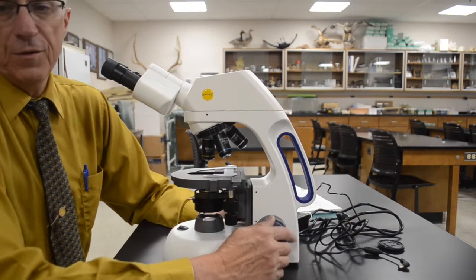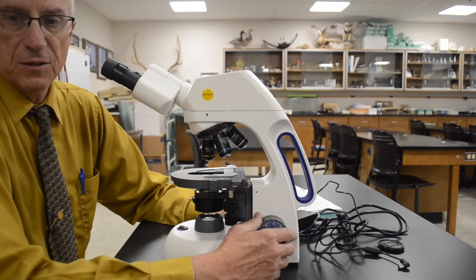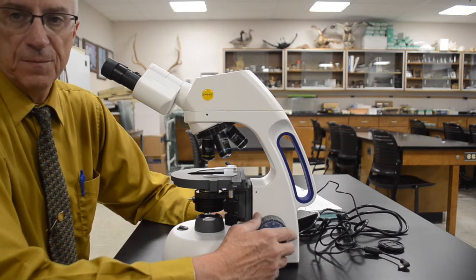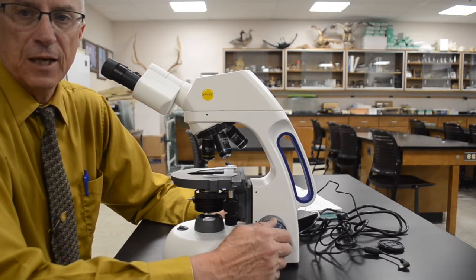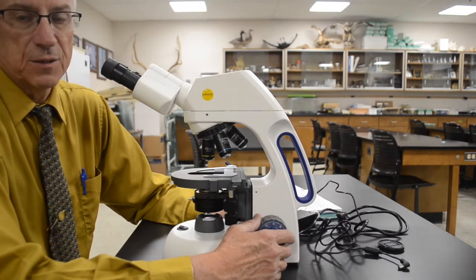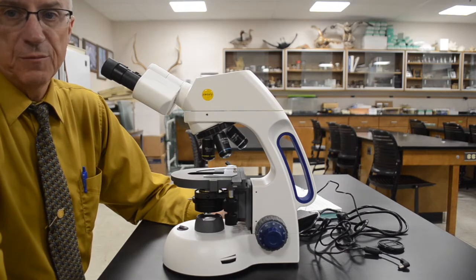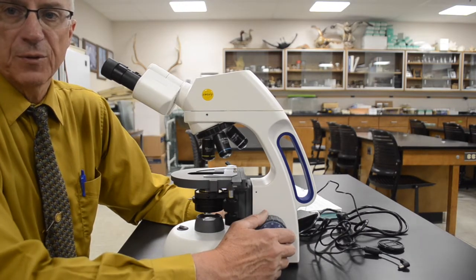One thing you need to know is that microscopes are complicated pieces of scientific equipment. If they're well cared for and well treated, they will last a long, long time. If they're not, they simply won't. And believe me, on school budgets, you do not want to have to replace microscopes.